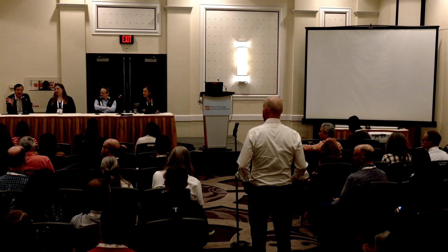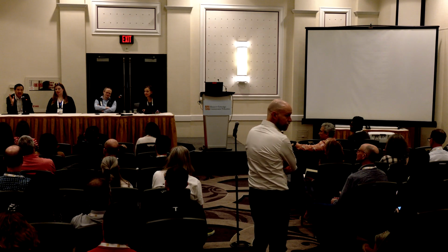Great question, and there's always a gap between the ideal and the reality in a situation. I think each one of us is a data steward, that we're responsible for data somewhere along the life cycle. And so how does the institution benefit? Just on so many parameters. For compliance, you reduce risk. You enhance institutional reputation by having solid data management. We're creating gold standard data sets, because if you don't have gold standard or regulatory grade data and you want to create an FDA regulated product, they're going to say, no, sorry.